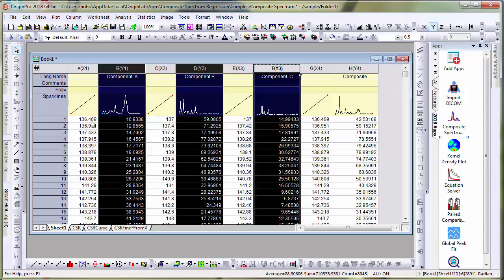Note that the X values do not have to be the same for all the spectra. They can be different and the app will still support working with such data.